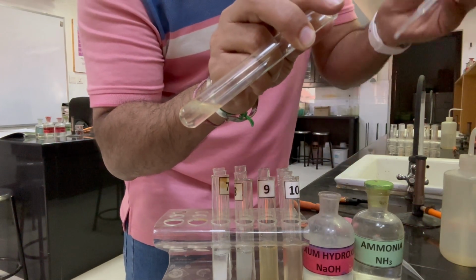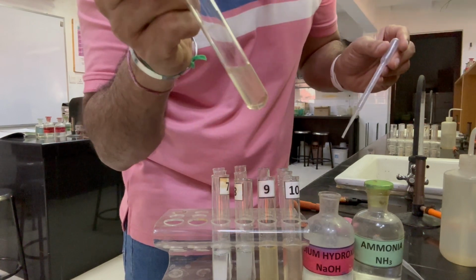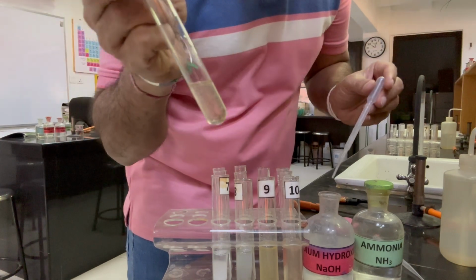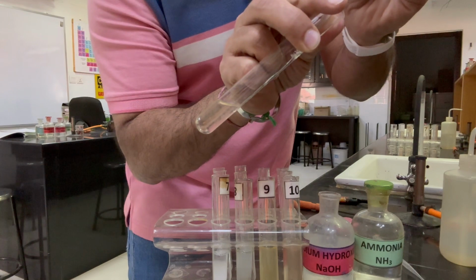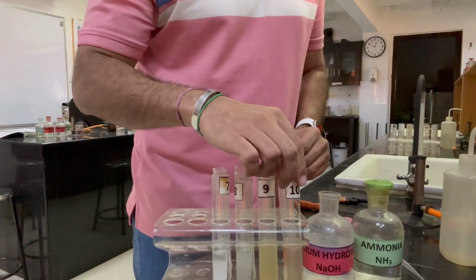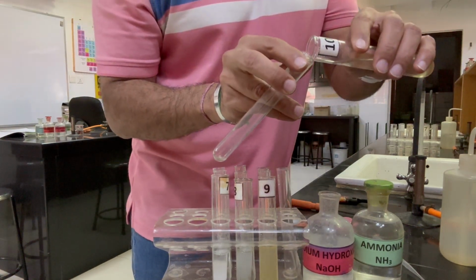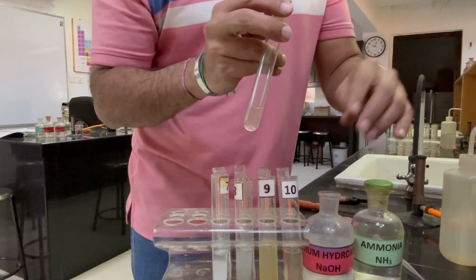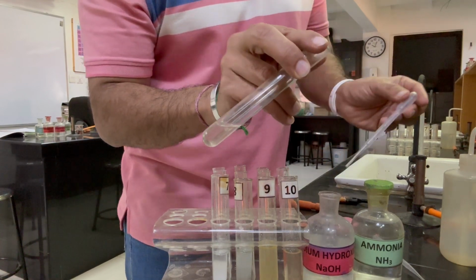And if we add sodium hydroxide in excess, we can see the precipitates are dissolving. Confirm by adding more. So they are dissolving. Now let's move on to the next, FA10, 1 centimeter depth of FA10, and add sodium hydroxide first.